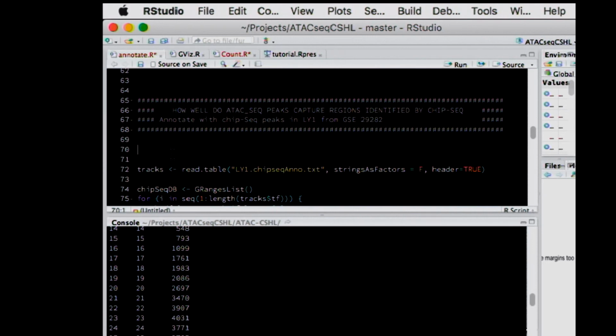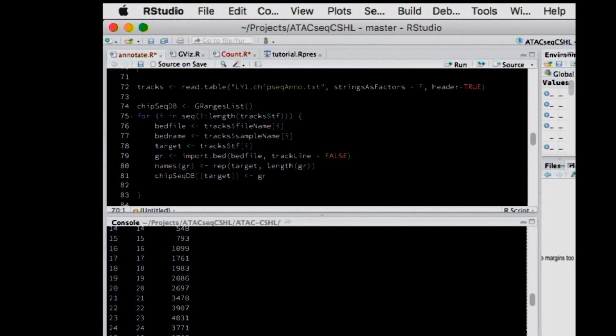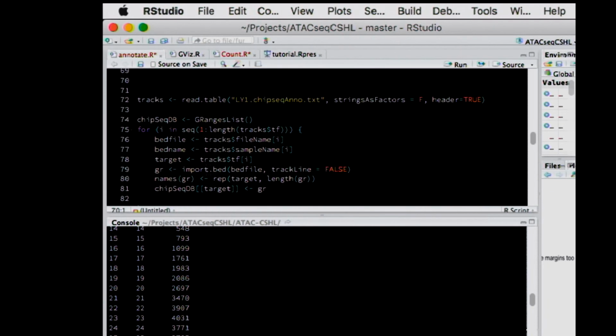And then transcription factors are probably a little more specific to the cell type we're interested in, and even more to what sort of questions we want to ask. But if you're lucky, there's data available for this cell line for a number of these experiments, which is nice because across different cell lines and tissues, things could look very different, like where enhancers are. I included bed files, and the script will pull them up automatically.